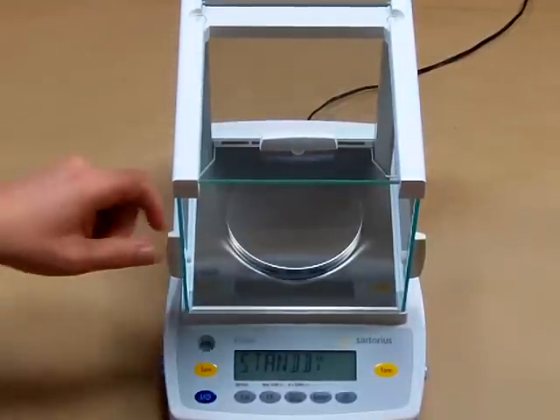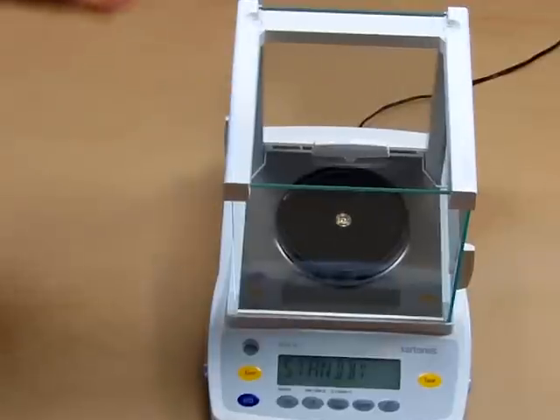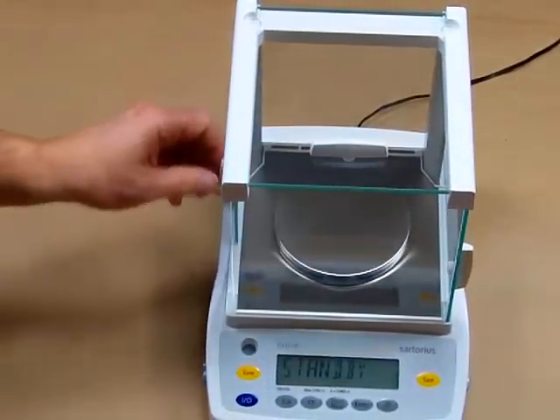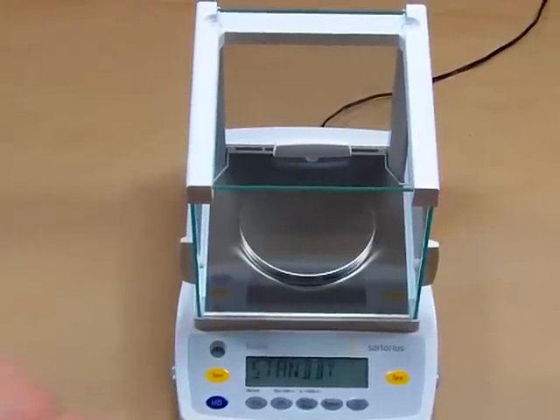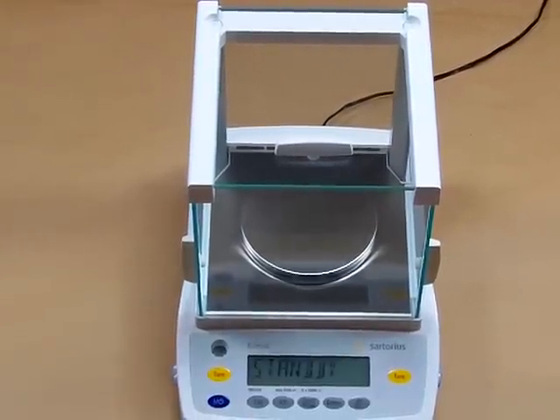The balance features a large four and one-half inch diameter stainless steel weighing pan. The balance also features a spirit bubble for easy leveling, and you'll notice it has a right and left tare key for easy operation.